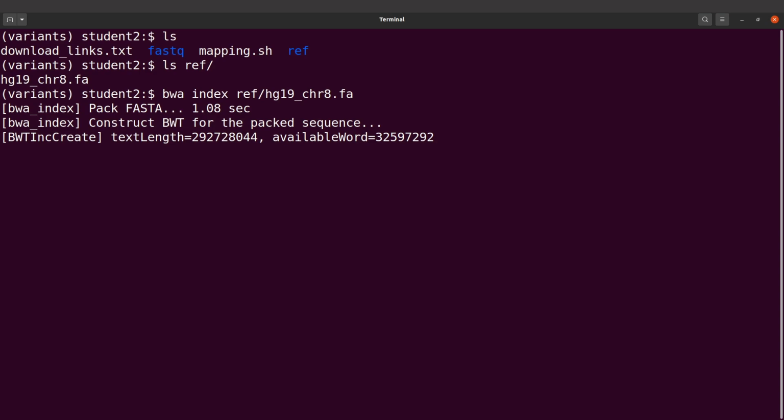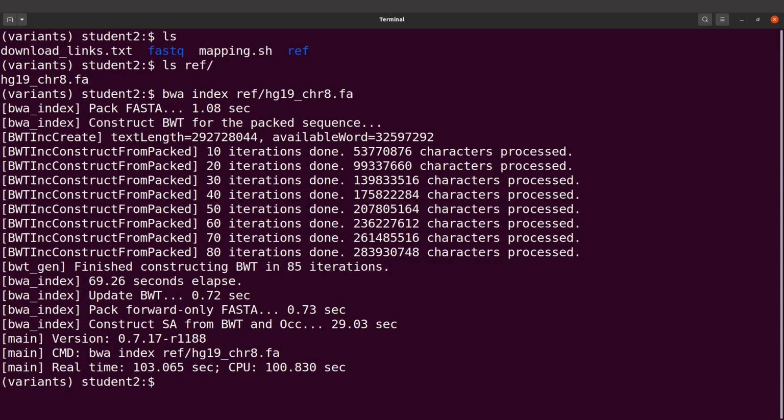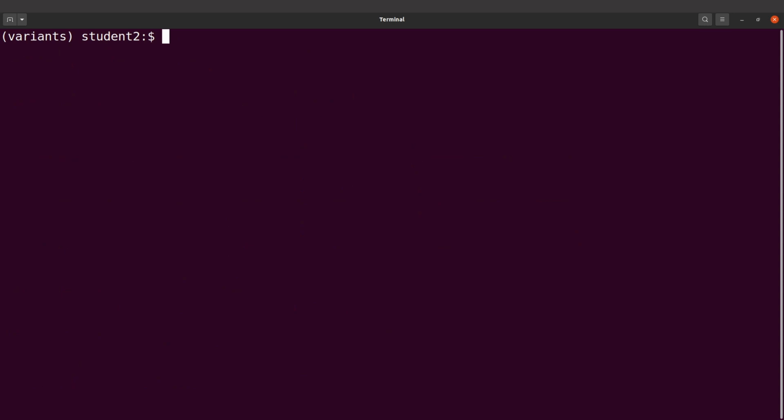And also with the tutorial, you can use your own data. Once you follow these steps, it will be easy for you to rerun it using your own data. So just take your time and follow the steps. All right, indexing has been done. So let's clear the screen and continue.